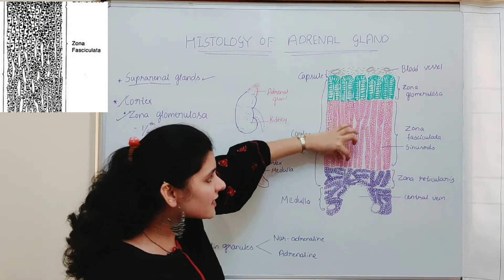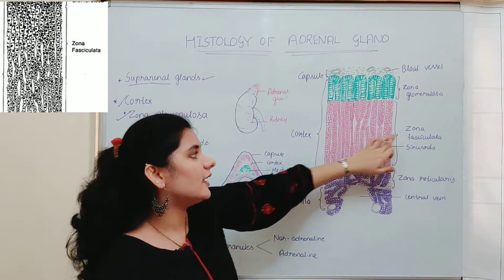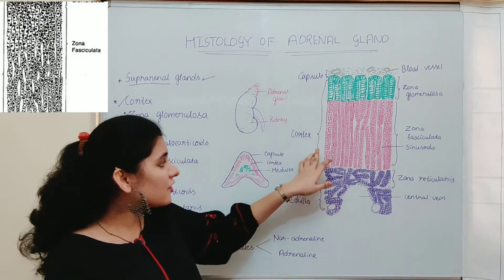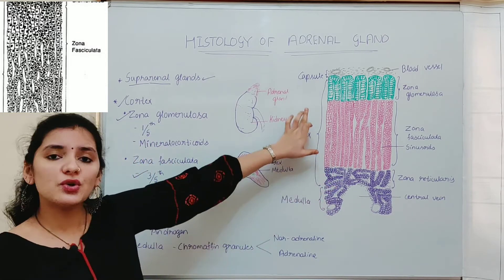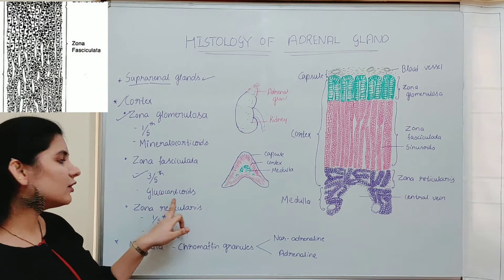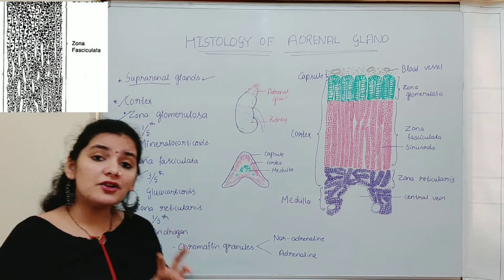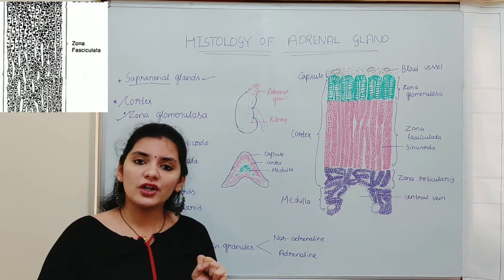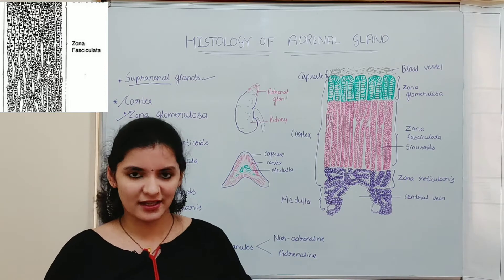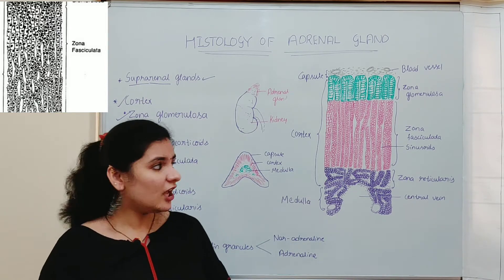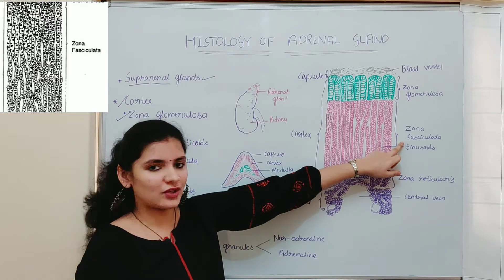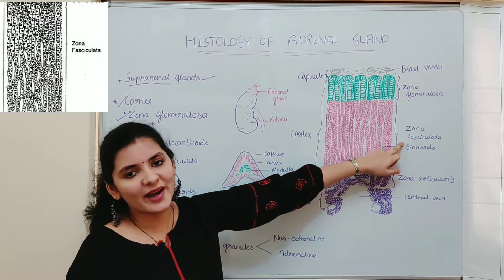The columns of cells in zona fasciculata are arranged parallelly. The function of this zone is the production of glucocorticoids, which maintain carbohydrate metabolism in the body. Zona fasciculata is the widest part of the cortex.